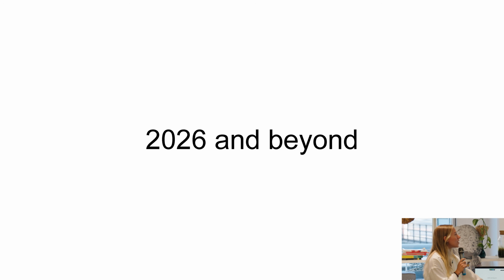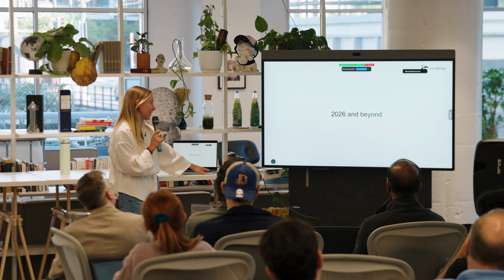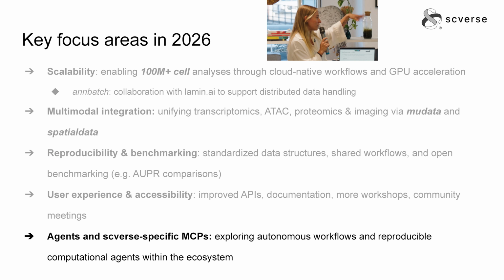So where we are and what are we doing later. I kind of skipped the first part. They are always very important. We have been doing them 2025, 2026, probably since we started 2022. We've been trying. We scaled more than 100 million cells to analyze. We do multimodal, any modality. Nowadays, we basically try to do all things single cell. We started as transcriptomics, but in reality, single cell is a resolution. We need all the modalities to understand the cells, to understand the drugs, how they interact.